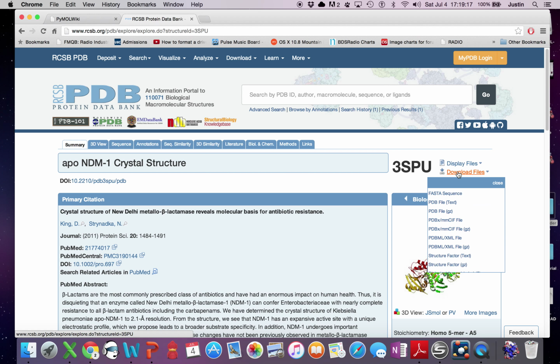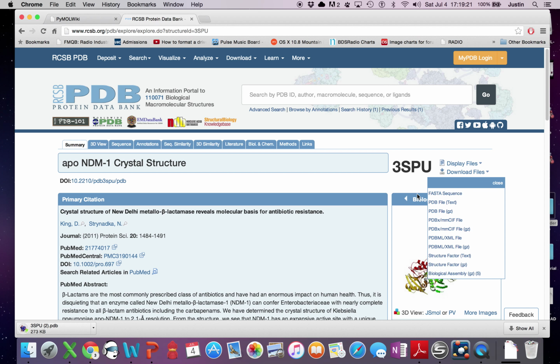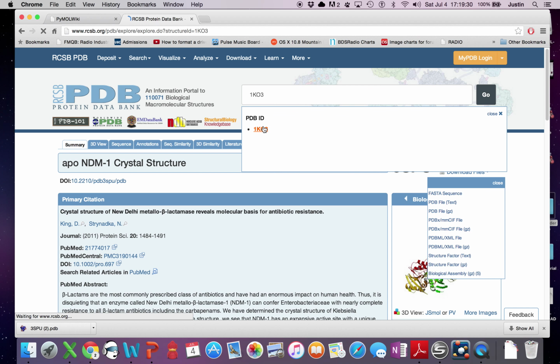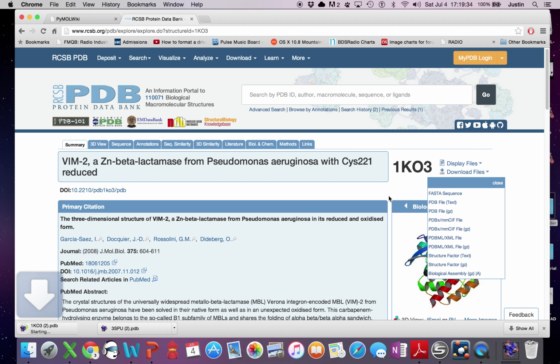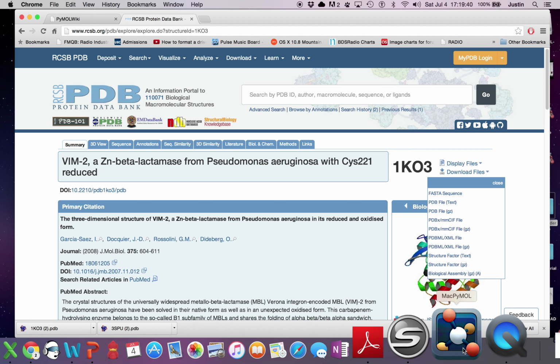So we're just going to download the files, go to PDB file and text, and we're going to download that. It goes directly to your downloads folder. The next file we're going to download is 1KO3. So 1KO3, go download files, PDB text, and we're done. So we downloaded our PDB files. We're now ready to start working with Pymol.